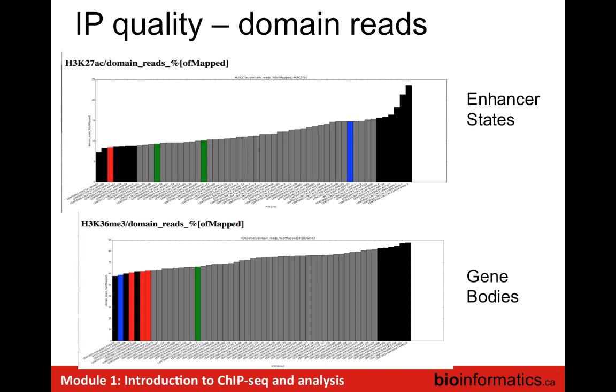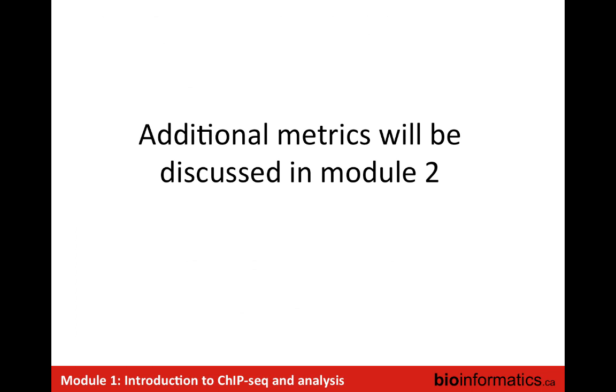It's a very simple way of looking at your data, convincing yourself that this IP is of good quality and worth pursuing, right? Don't just jump in, generate WIG files, and start looking at the data. You must look at the quality of the data before you proceed. Okay, so with that, I will stop. We will talk about additional metrics in Module 2 with Misha.